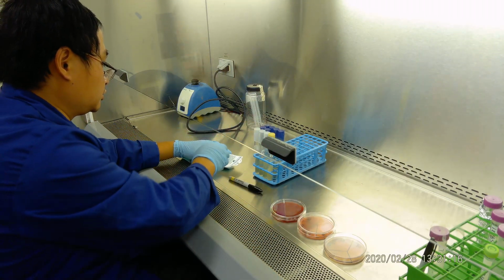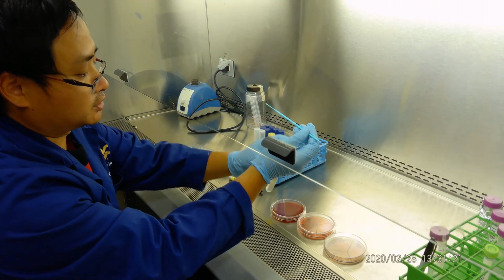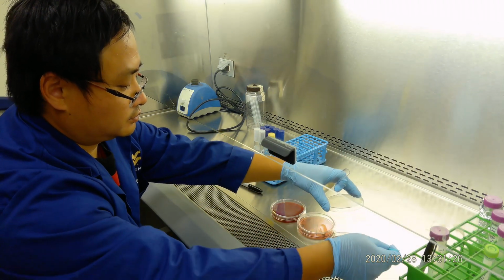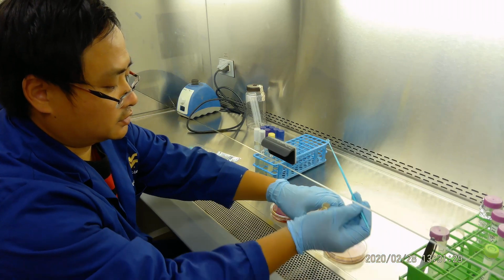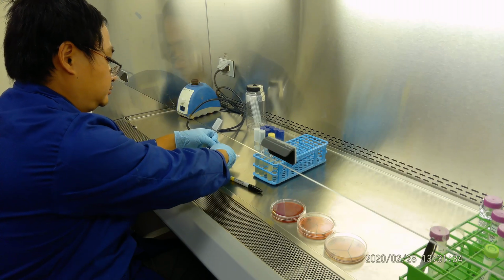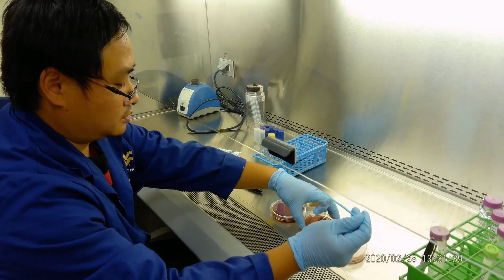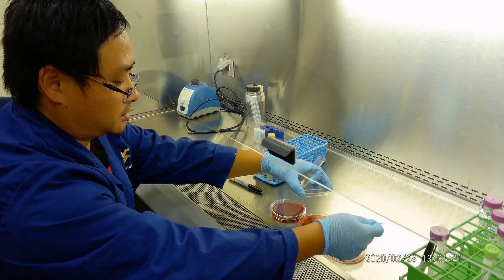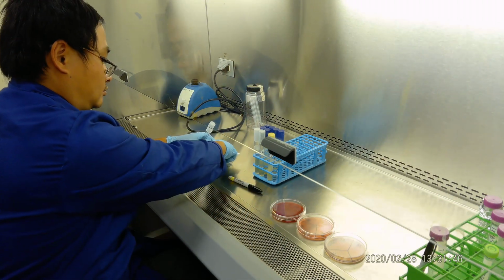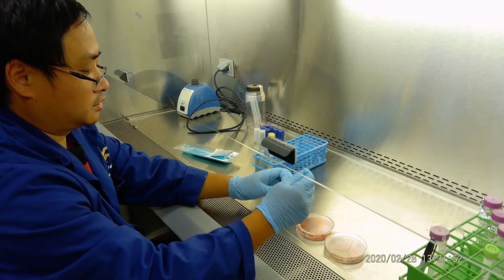Then the second one we're going to do is E. coli. So we do the same thing. So we put E. coli. So we streak E. coli there. We streak E. coli.